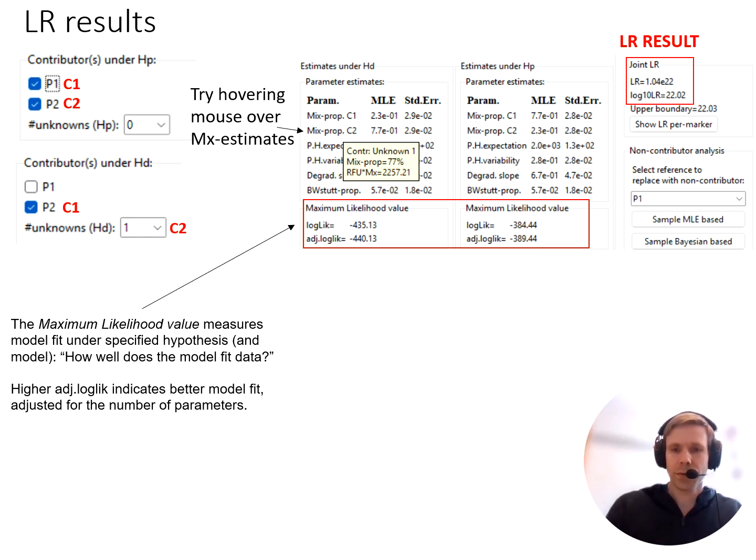So what we use as a model comparison is the adjusted log likelihood. This is what is used in the model comparison, the automatic model selection feature. We will come back to that soon.